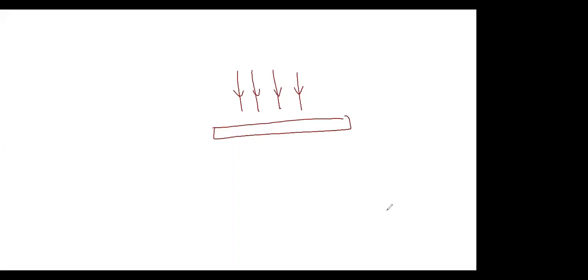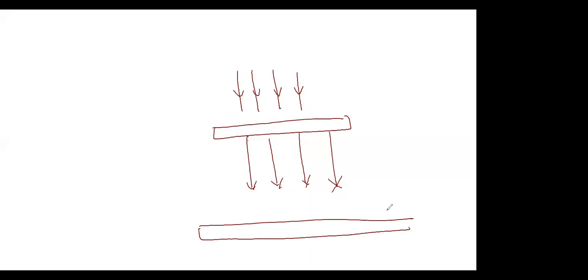So electron beam can come like this, a straight parallel beam, and this is your sample. And this electron beam can go like this. Primary electrons I'm talking about, not the secondary electrons. Then you can collect them and make an image out of these electrons here.